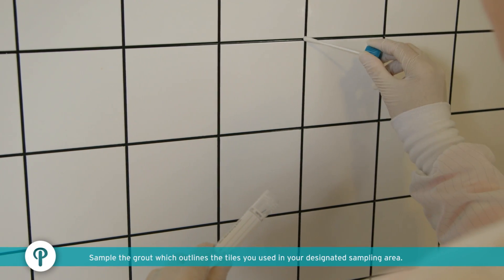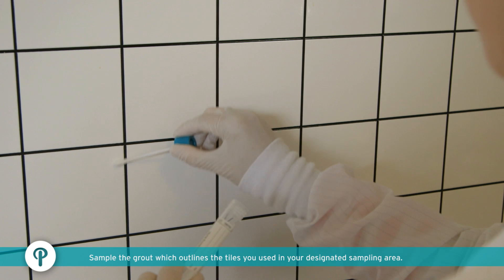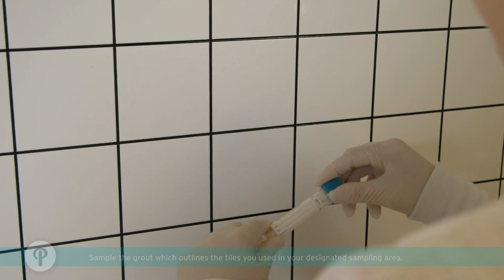Sample the grout that outlines the tile and/or the designated sampling area by rubbing the swab with firm pressure along the border of the tile.